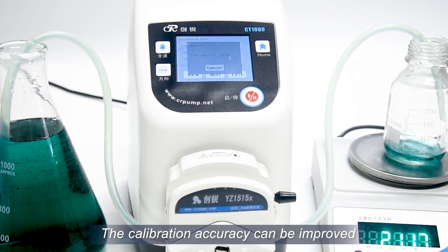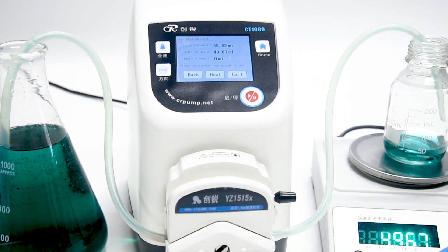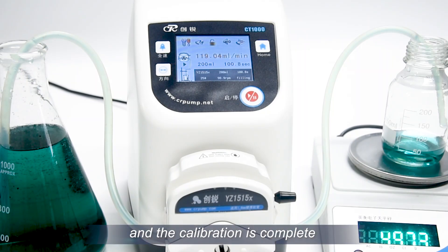The calibration accuracy can be improved by transferring the fluid volume multiple times. Click next and then click finish to exit back to the main interface. The calibration is now complete.